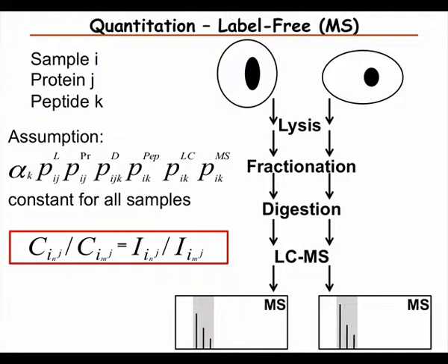It works quite well if one can do the measurements over a short period of time. It gets more complicated if one measures hundreds of samples and it takes months to do the analysis. But even that people have done quite successfully. And the trick is then how to normalize properly between the samples that have been measured.